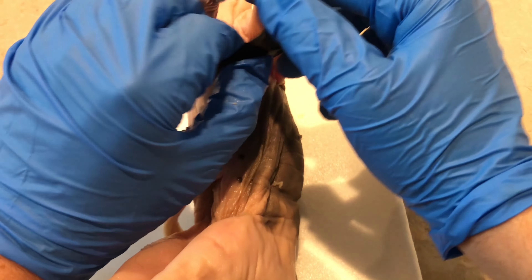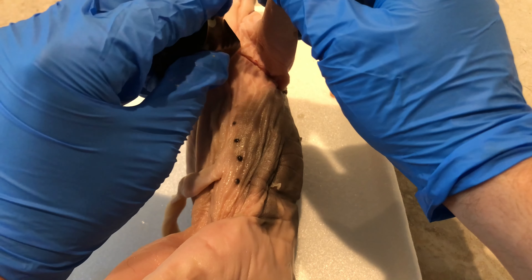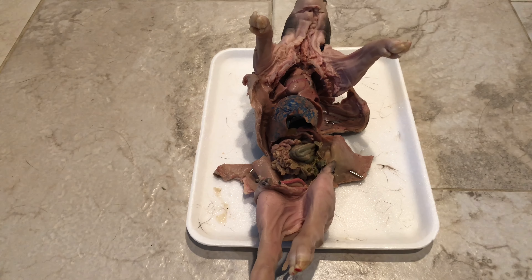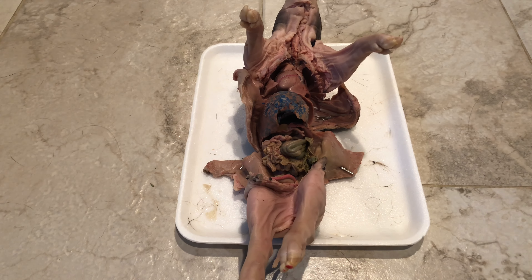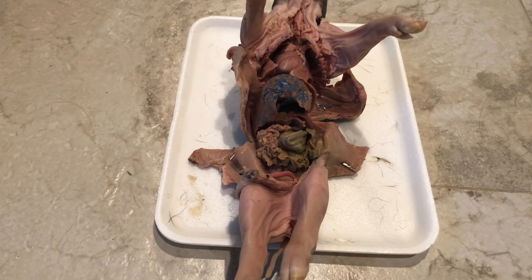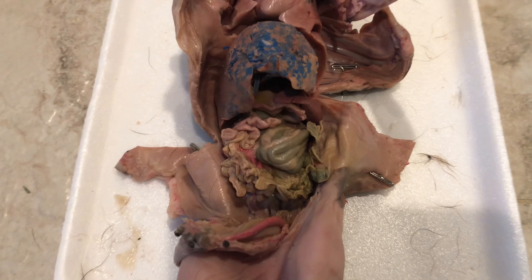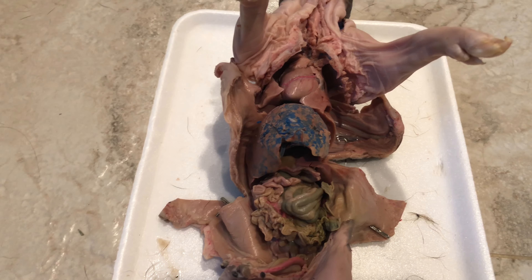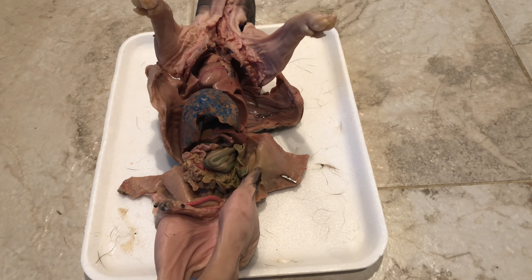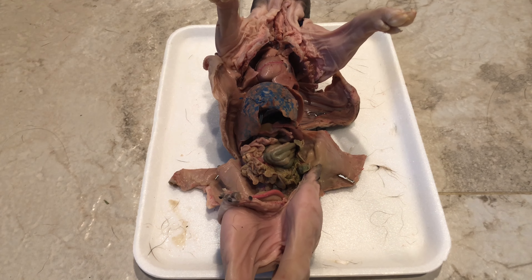I didn't get the whole dissection process on film because it would have been a really long video. But I just finished dissecting the fetal pig and I was able to pin its skin flaps to the tray. I did it entirely with the obsidian - I didn't need to use any modern tools, which I think was pretty cool. Everything you see here I cut open using the obsidian blades.